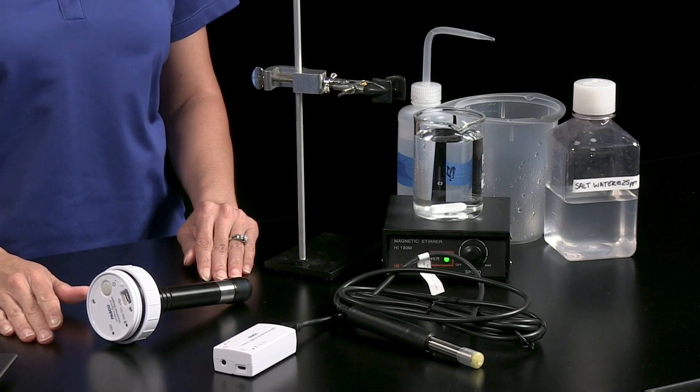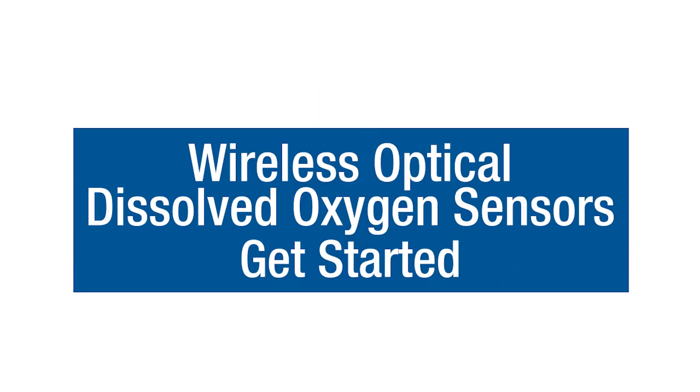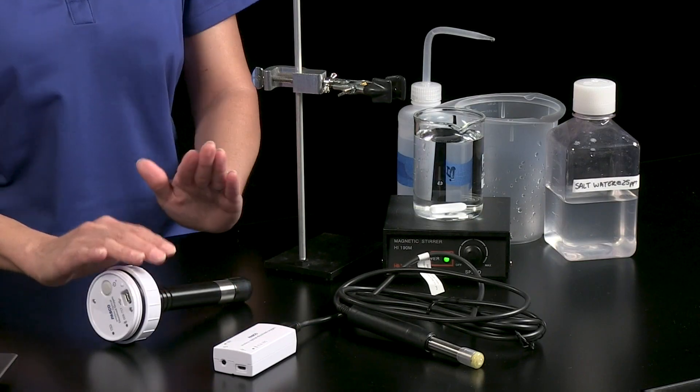In this video, we'll explore how you can use a wireless optical dissolved oxygen sensor to study a variety of phenomena, and we'll cover ODO sensor care tips to keep the sensor performing at its best. Regardless of which PASCO wireless optical dissolved oxygen sensor you have, the measurements are automatically adjusted for ambient pressure and temperature conditions, and calibration is optional.